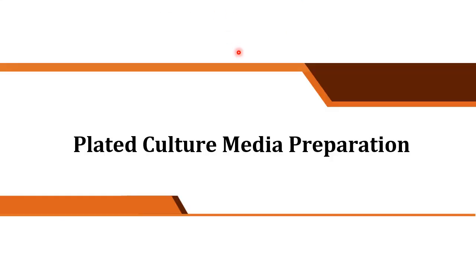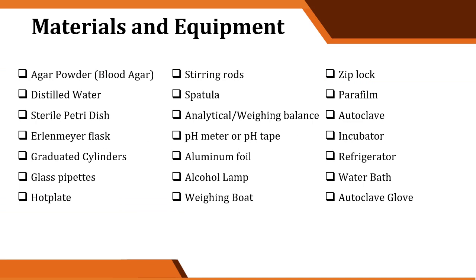Okay. So, let's focus first sa plated culture media preparation. So, ito yung gagawin ninyo on your activity. So, these are the materials that you're gonna be needing sa ating activity. So, we will need the agar powder, so yung blood agar base.